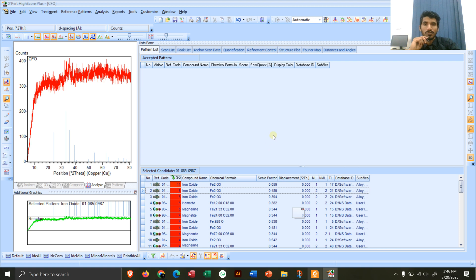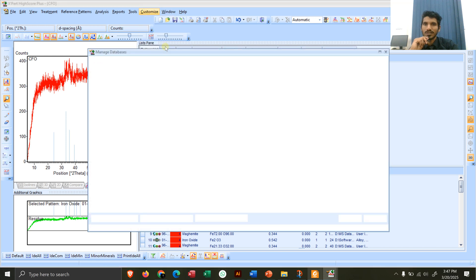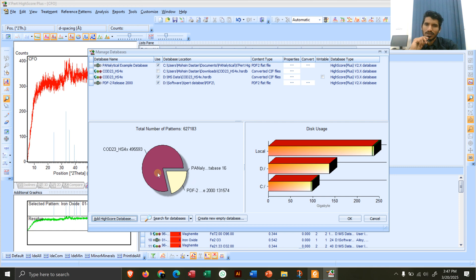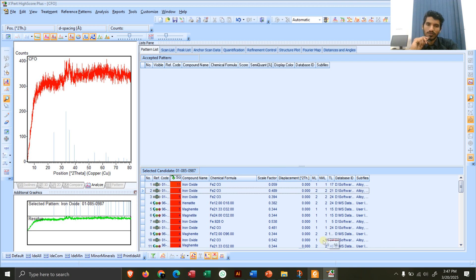One more thing: if you do not have the database, you need to download it in order to match the peaks. Under Manage Database, you can see I have a database containing around 495,000 entries and another with around 131,000 compounds — so roughly six to seven lakh compounds total. Whenever you search, it is matched against this database, so it is important that you have a good database. That was all — thank you, and if you have any questions you can ask in the comments.